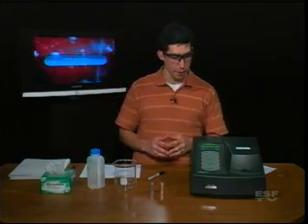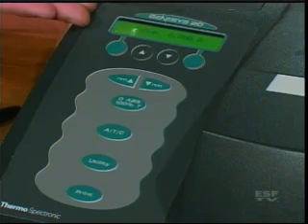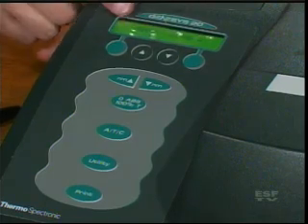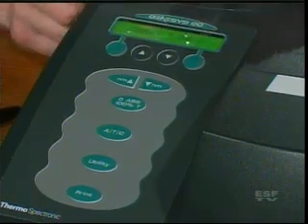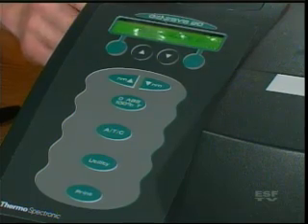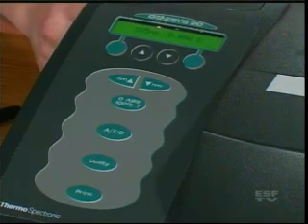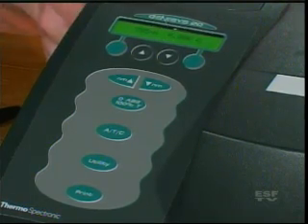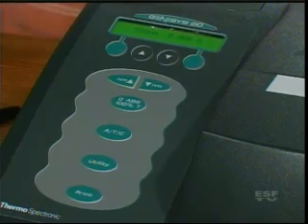So let's quickly walk through the parts of the Spec 20. First, we have the LCD screen, which tells us the wavelength of light that we're interested in, that we're going to look at, and then the value of the absorbance. Typically in chemistry, we're going to look at the absorbance, but we could also measure the transmittance, or how much light is getting out.